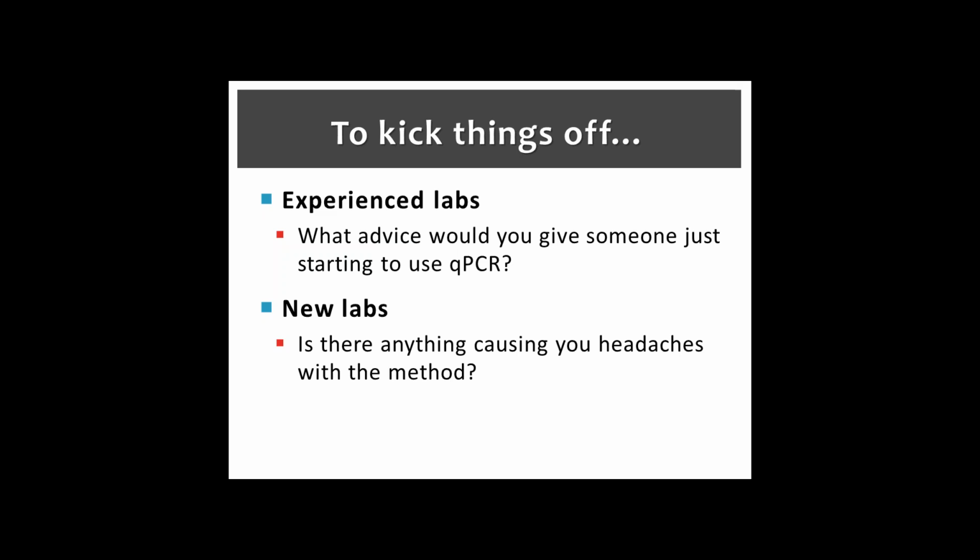So when we have those QAPs, method C is what we're talking about, for the online people. With method C, you're saying that the stepwise directions are all in there, but they're kind of sporadic. Would it make sense that we would do a front-end primer that says, here's how you make your solutions? Is that in the training manual? Yes, there are some cheat sheets, a checklist to make sure we have done all of these steps so we're actually ready to go, so you're not flipping back and forth through the manual. But we can make sure that those are easier to find.